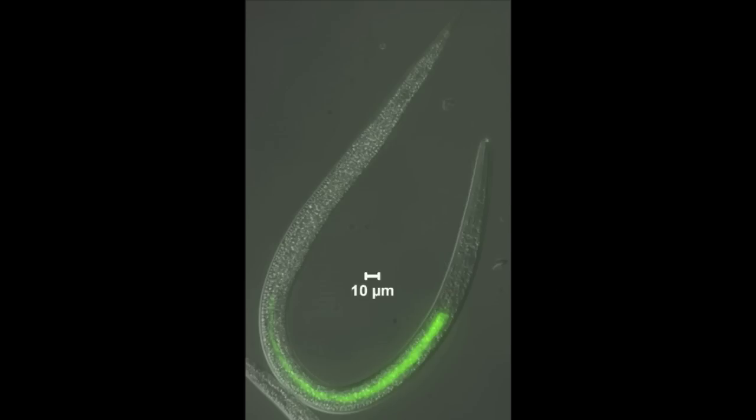Our bacteria is labeled with green fluorescent protein and is green in this picture. As you can see, it's in the intestine and not in the pharynx.